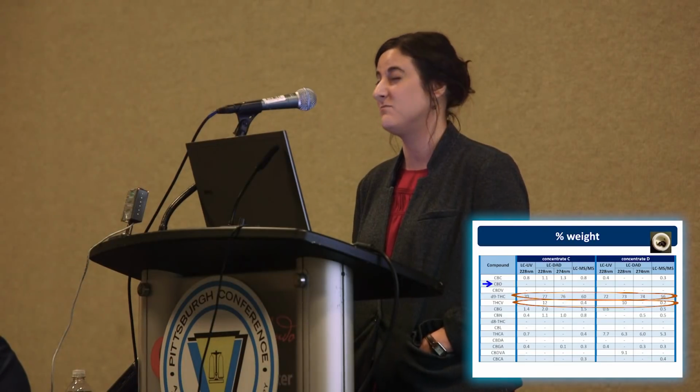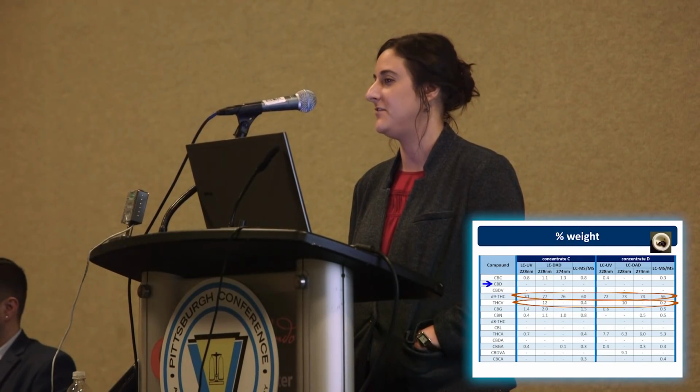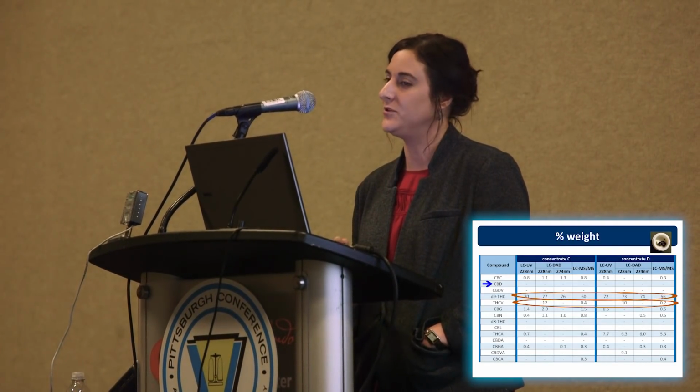It could be the fact that we're legitimately seeing signal added because it's UV. There are other compounds in there that we're unaware of. It can also be, and this is actually my suspicion, that even though we tried to be really diligent about where we were calibrating and the levels we were using for LC-MS-MS, we may have been in a region where it wasn't quite linear, or there was the potential that there was some saturation that we weren't aware of, detector saturation. So I'm not 100% sure exactly what the bias is here, but it's curious that it's happening on the high percent THC, where we had good agreement when the signal was lower. So there's something interesting about that.